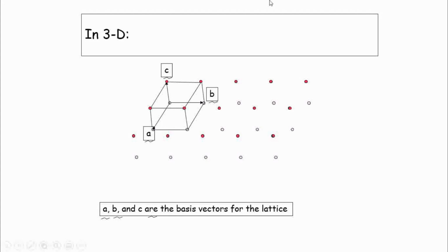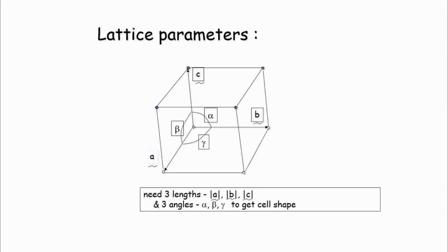Why did I start with dots? Because I wanted to give you an understanding of a plane, and once we have multiple planes we can join these dots to come up with a 3D structure. That is how, from a single plane, if we understand the lattice orientation, we can decipher the information and interpolate it into the 3D structure, which is actually the structure present in your crystal of interest, right?